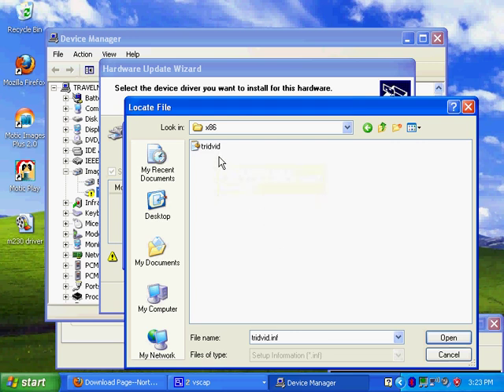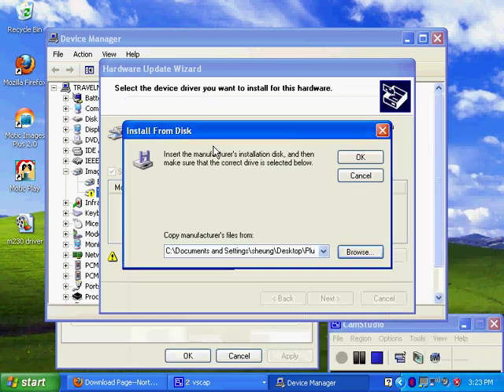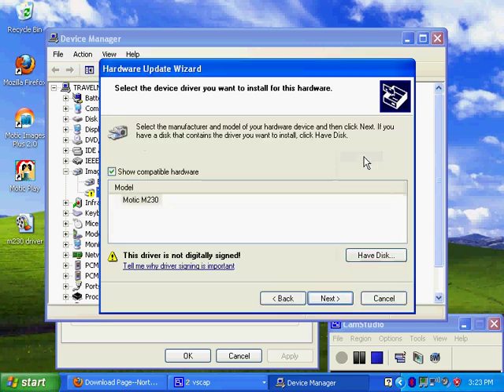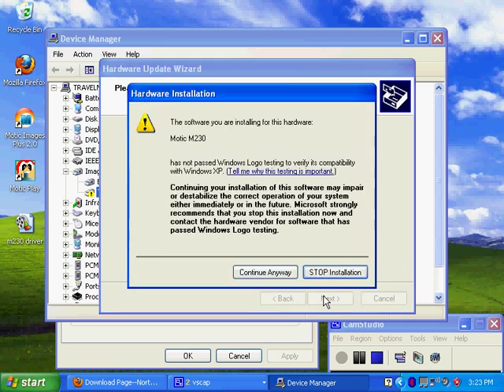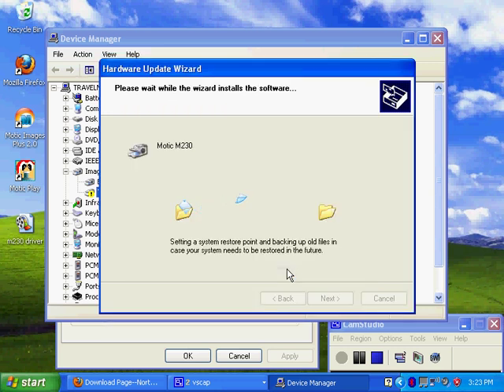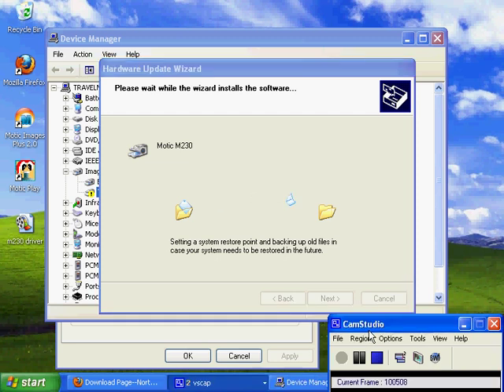Now let's double click on the file. Then click ok. Then click next. Windows will come up warning you that this driver is not a digital design. I can assure you there's nothing wrong with the software. So you can continue anyways. For efficiency purposes, I'll pause this part of the install just to speed up the video.